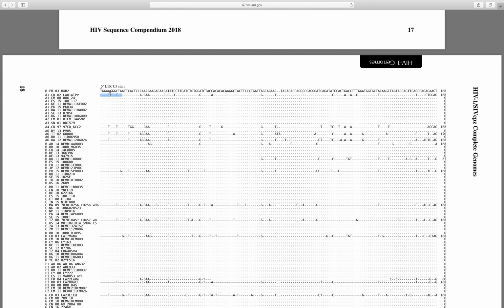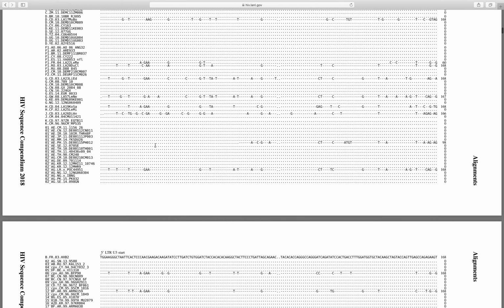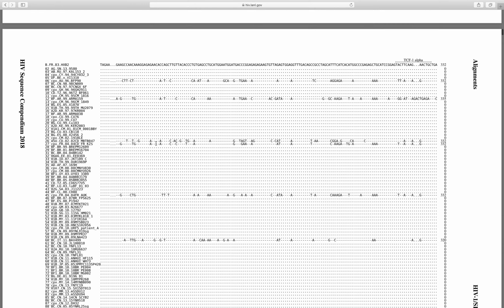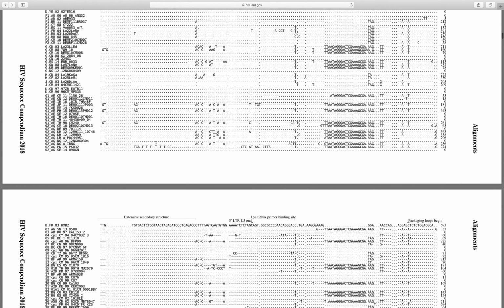So for the A's, it seems like of the A's that are there, all of them have a T in this area, except for in the sequences that you can't see what's going on. And you can actually see that most of the sequences here are actually fairly conserved, which is what we would see whenever we're looking at different viruses that we're claiming are related to each other. So this is pretty sparse, so we can jump into areas that have more coverage.